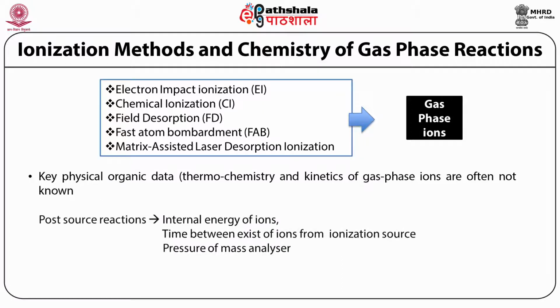The post-source reactions, especially internal energy of ions, time taken between exit of ions from the ionization source, and pressure of the mass analyzer, make a lot of difference, especially once the molecule is ionized by the ionization source, towards the detection. In between these two events, whatever is happening depends upon all these factors.